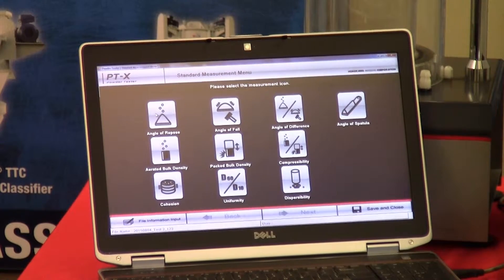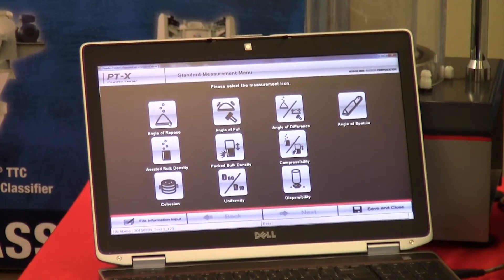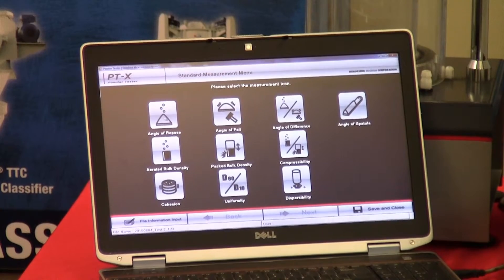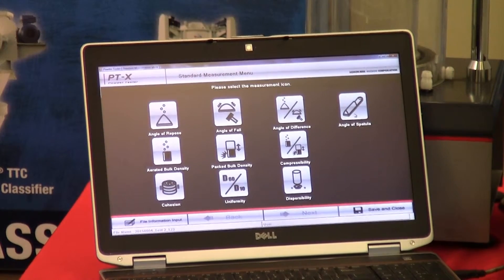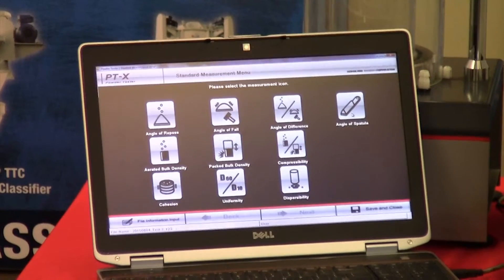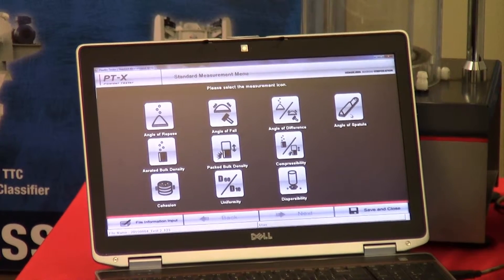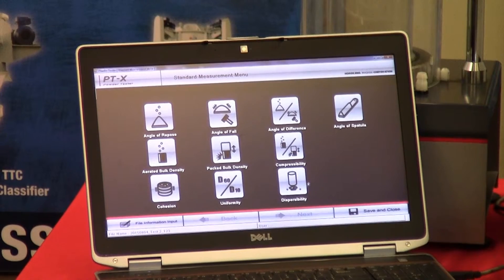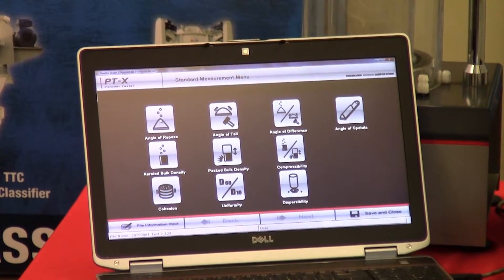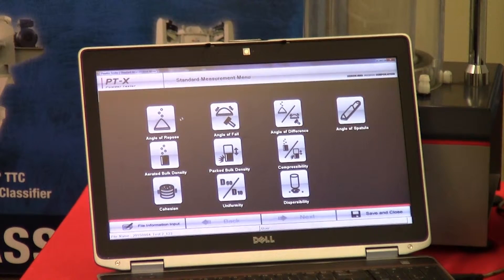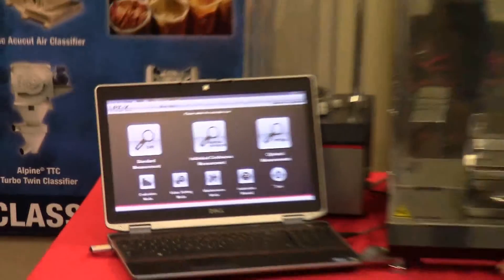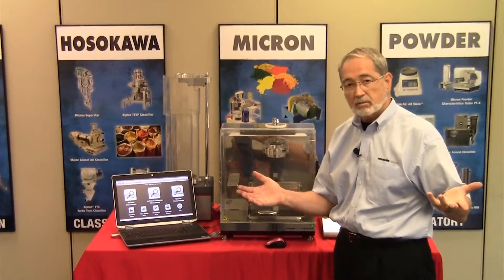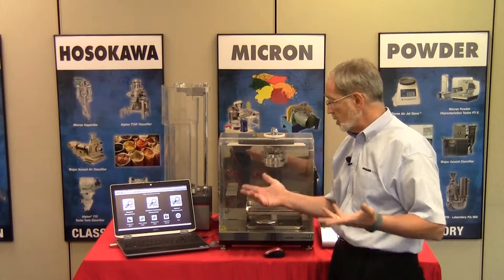The tests do not have to be performed in sequence. However, my suggestion and recommendation is to perform your angle measurements first, because if your material happens to be cohesive it's not going to affect any of the measurements. Then do your density tests and then your cohesion tests. Once a test has been performed, the icon will become grey rather than black. You can then save and close — we identified the test name and close it out.